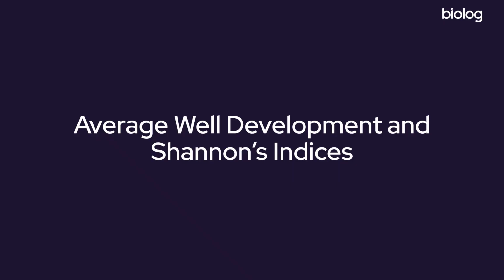The first community analysis metrics that we're going to be talking about today are average well development and Shannon's indices, which are really helpful in determining the overall metabolic health and flexibility of your community.